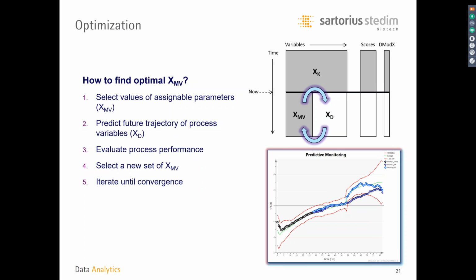Okay, so that's the way the optimizer works. Again, a very quick explanation, but if you want more details, you can always contact myself or anyone at Umetrics.